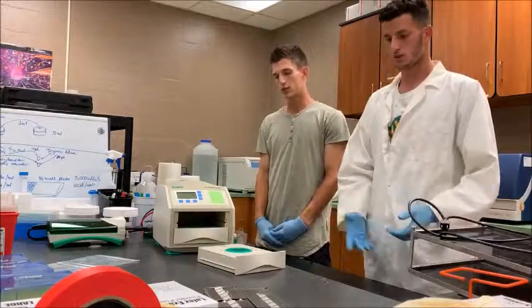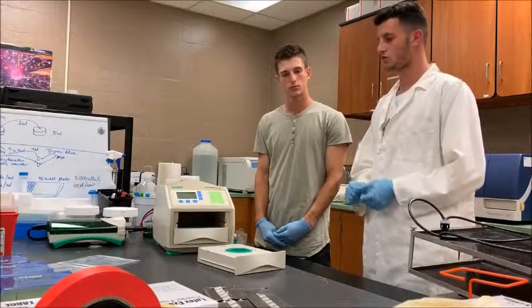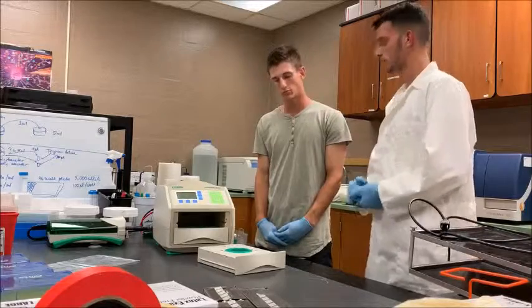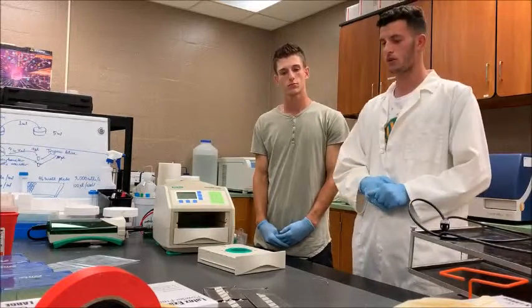Okay, awesome. So there's no real interpretation of results, as you have just to transfer from the gel to the membrane, and then Western blotting will confirm if it went through well or not.